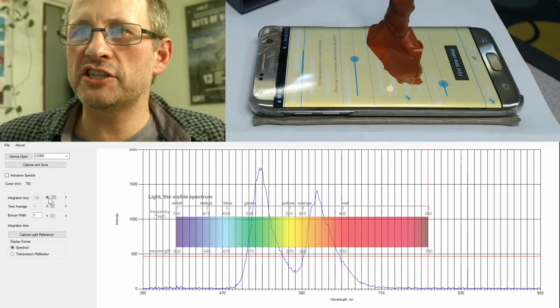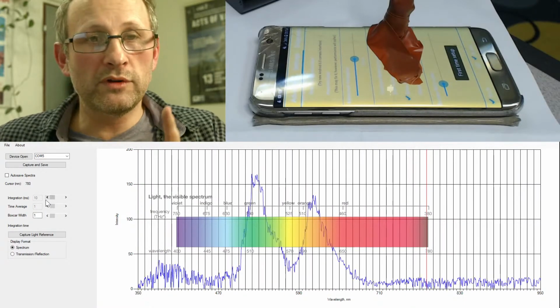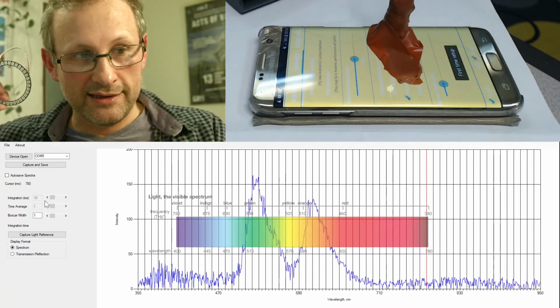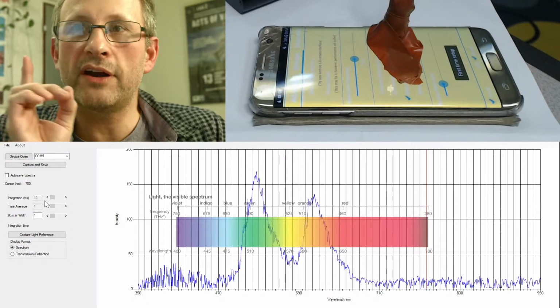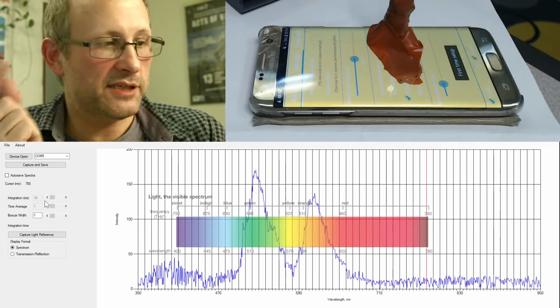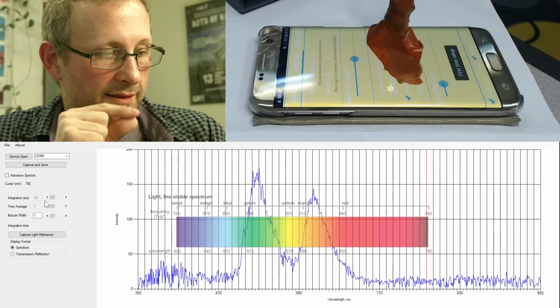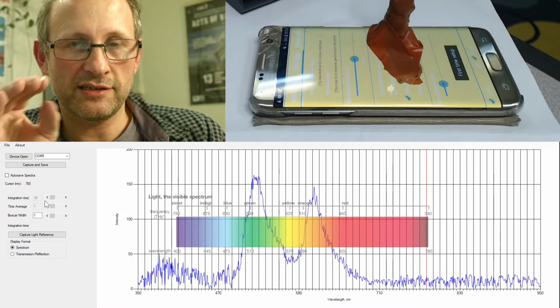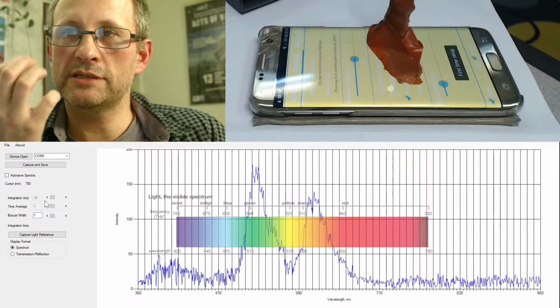And so if I actually change the integration time here, you'll see it becomes a little bit rougher. What I will say is that when I was using these bright LEDs, these bright ones, 10 milliseconds was more than enough to get a very clean spectra. And that was true when I was looking at the reverse side of the phone camera, the actual white LED, seeing that spectra that I've published on the title frame of this presentation, and that was much clearer.